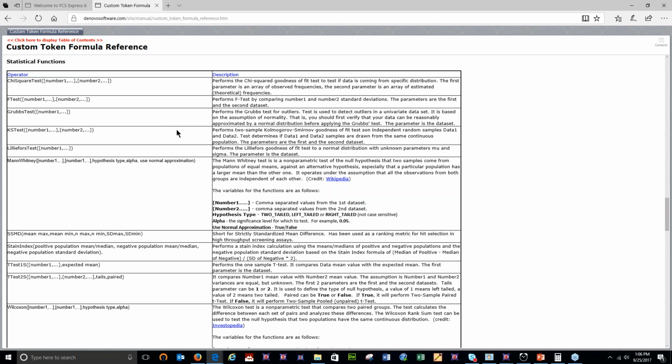Others are a test of the suitability of your assay for scale-up to, for instance, high-throughput screens. So we've got 3 or 4 broad categories of statistical tests you can choose from. So we do have a chi-square test. I just want to point out that that's the goodness of fit chi-square. It's not the chi-square based on contingency tables that some of you might be thinking about.